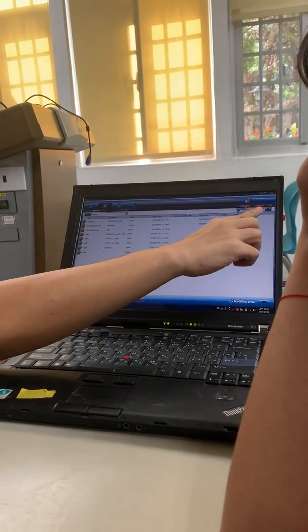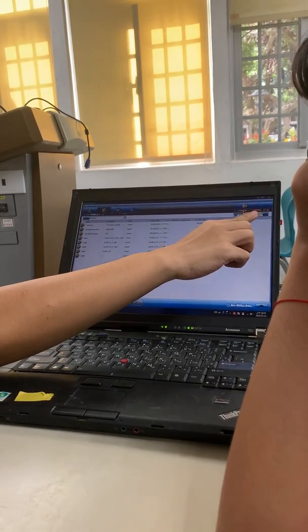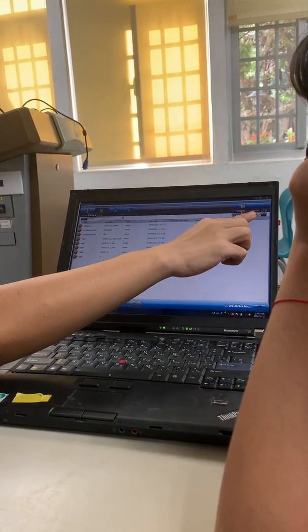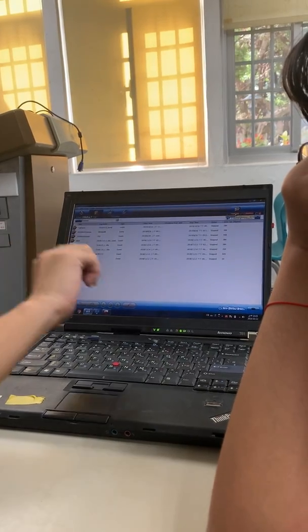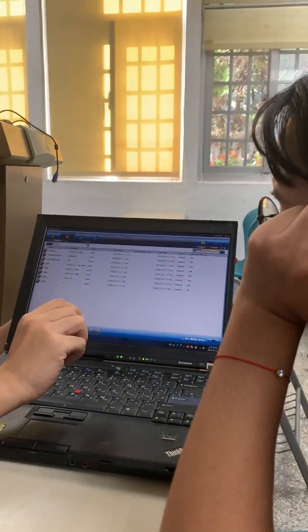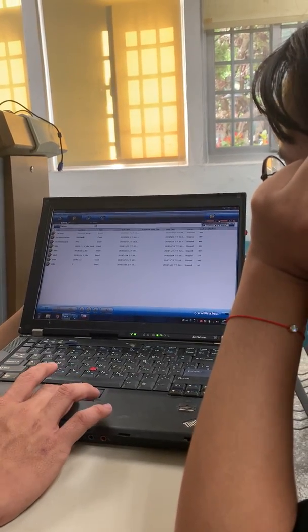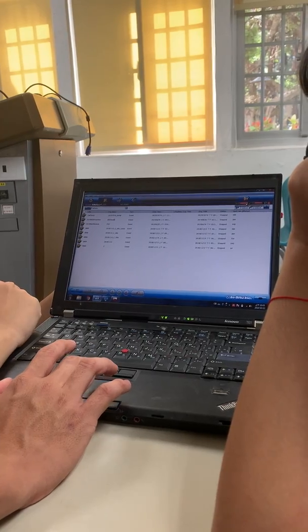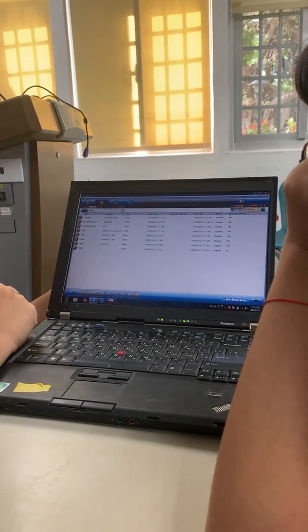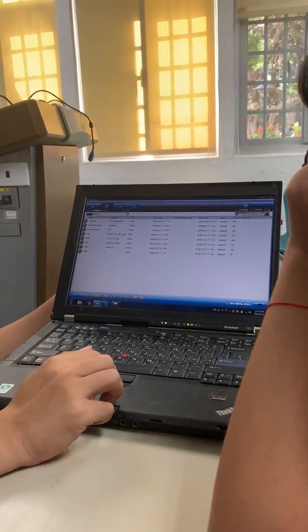The battery indicator is on the right-hand side and on the left-hand side. The battery cannot be recharged. We just use the extra port. The devices are at about 20%, 15%, and 20% battery. Memory remaining is about 18%.